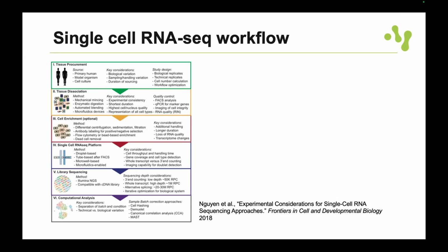Maybe you want to collect over time. Maybe you need to collect at a hospital that is far away from the site where you have your lab. These are considerations you need to take into account when you plan your experiments, and it can affect the method you can choose depending on the technologies.